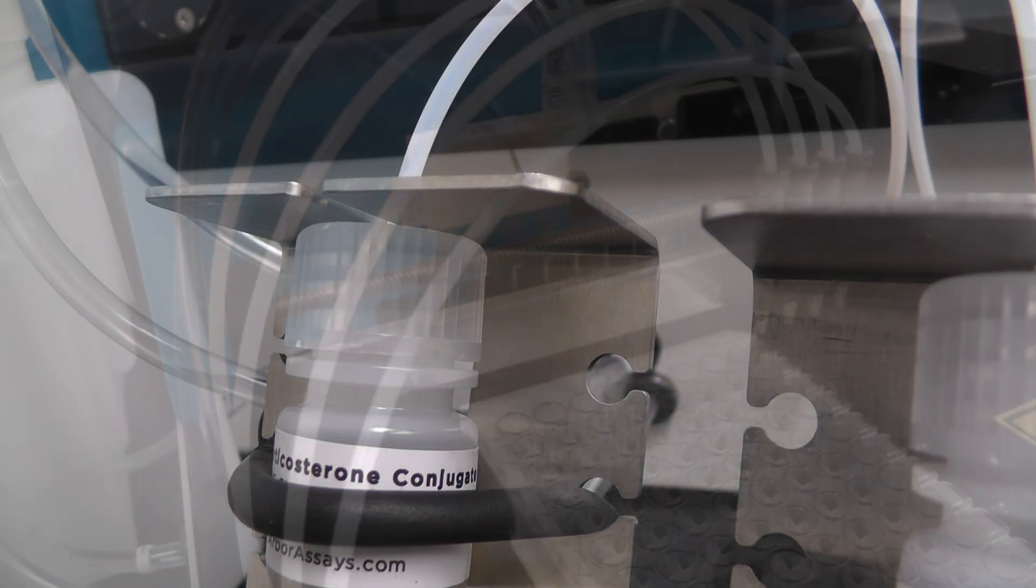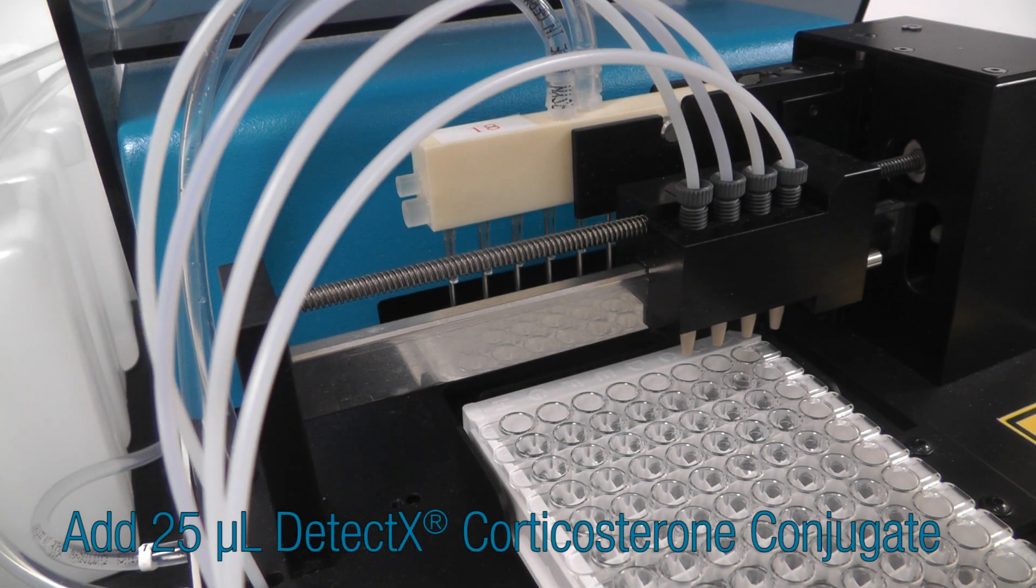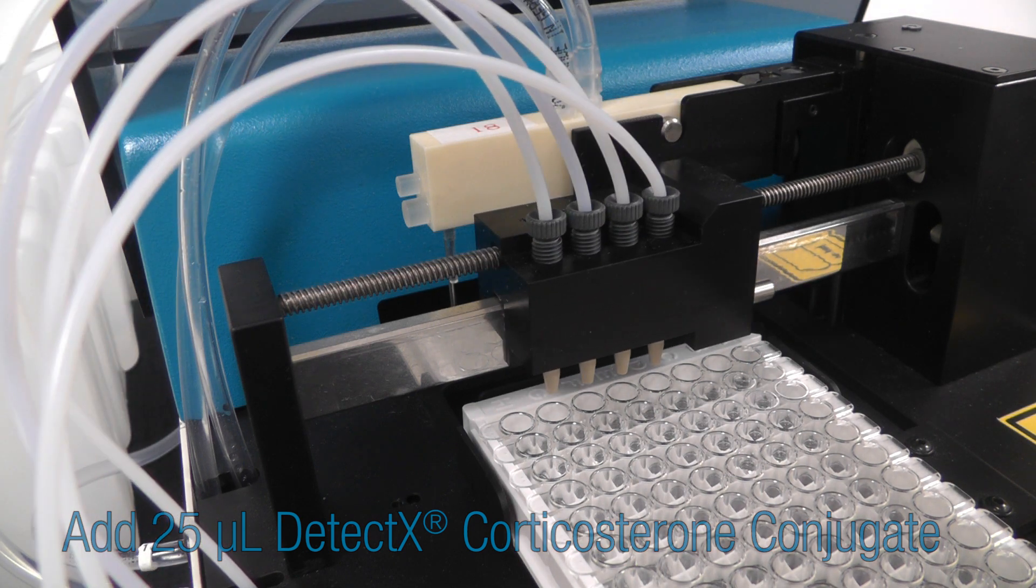Now we click start, and the crocodile begins by dispensing 25 microliters of Corticosterone conjugate to specified wells.